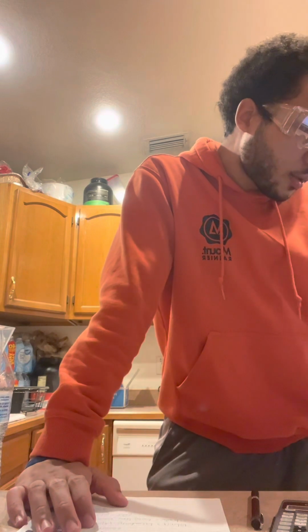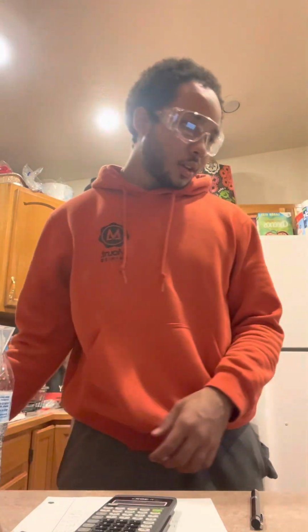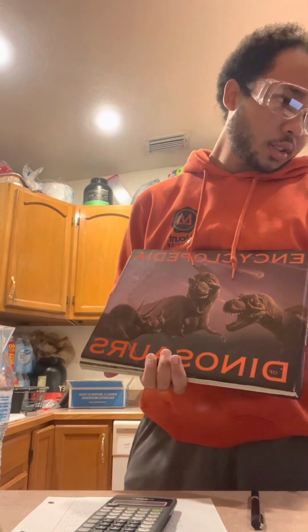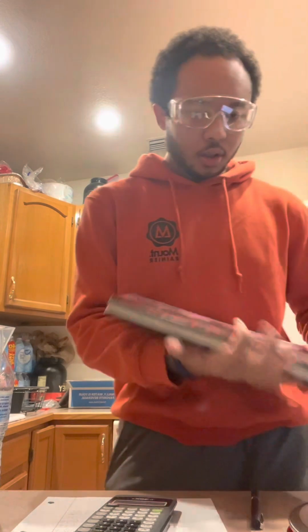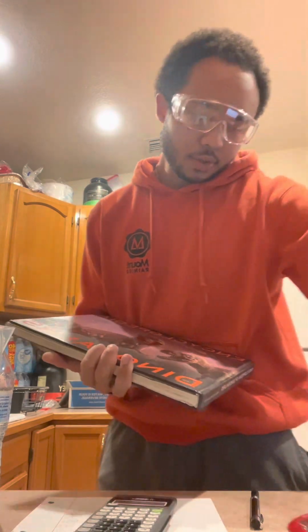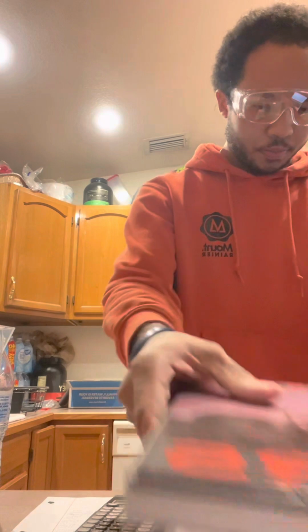Okay, here we go. So next we're gonna do mass. We're gonna find the mass of the block. So we obtain the block or book that we used from step 6, and it wants us to place this on our scale, which I got right here. Let me turn it on. Gotta give it a second. And I already have it set to grams, since grams is what you use when you're determining mass. So we're gonna set it on the scale.